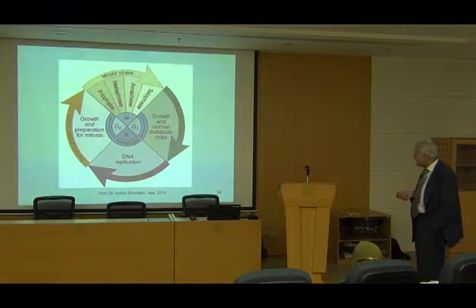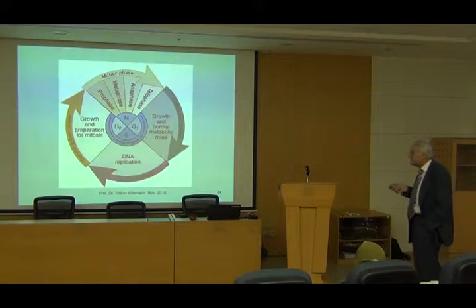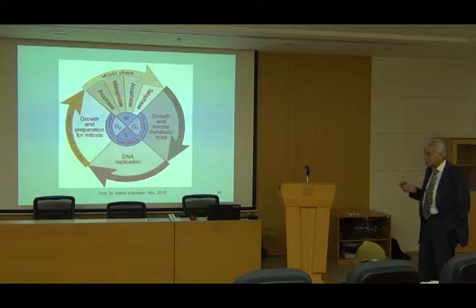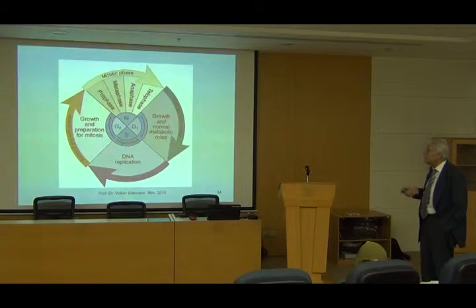In this picture you see the cell cycle. It starts with the first growth phase, the so-called G1 phase. DNA replication is in the S phase. Growth in preparation for mitosis is in the G2 phase. The mitotic phase is called the M phase. The mitotic phases, prophase, metaphase, anaphase, and telophase, it's not possible to measure each step. It's in general the M phase.